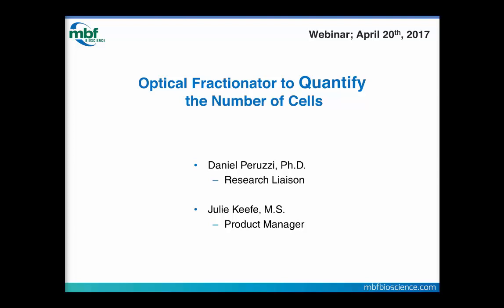I'm joined today by Julie Keefe. She is a product manager, and she has performed the optical fractionator many times, is an expert in it, and she's going to be helping me to field some of the more practical questions.